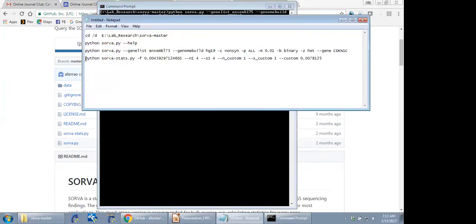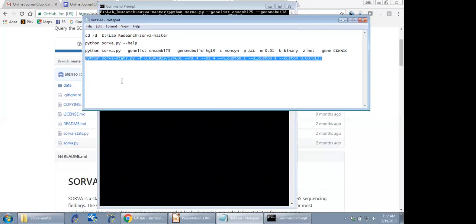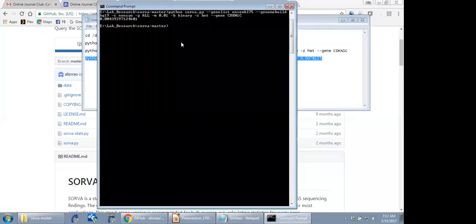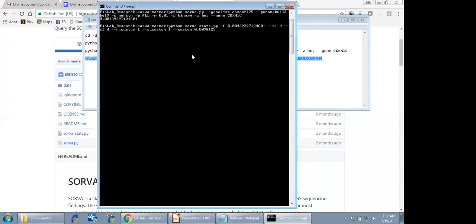And next, if you want to calculate a p-value, I wanted to mention that actually in the original research paper, the researchers were looking not at first cousins, but actually third cousins. So the relationship coefficient is actually 0.0078 instead of 1/8. And you can't enter that on the web query. So you can use the Standalone tool to run this query.